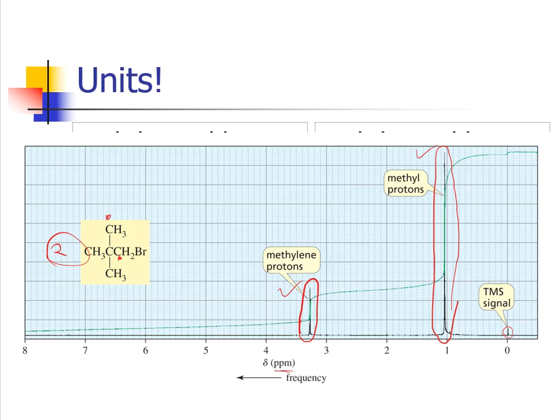You know, here they stopped at an 8. It's not a big deal. If there's no more that happens after a certain number, then very often in these images, they'll just chop it off at that point, and they won't really report any of that value after that part per million level, just to make sure it's cleaner, making sure that you put a focus on the major signals that you should put a focus on.